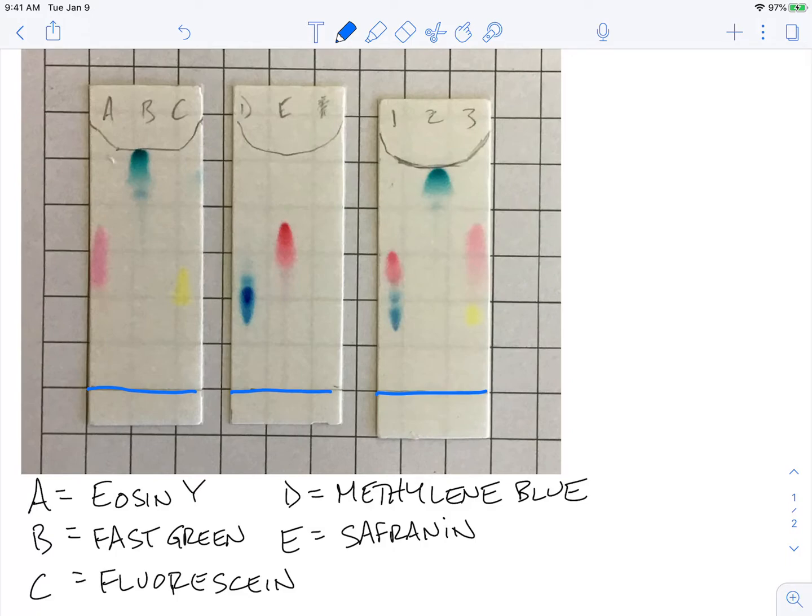And then these curves at the top were the solvent fronts. And I just traced them in pencil, kind of where they formed. And you can see that the solvent front kind of moves up the sides a little bit faster than in the middle.